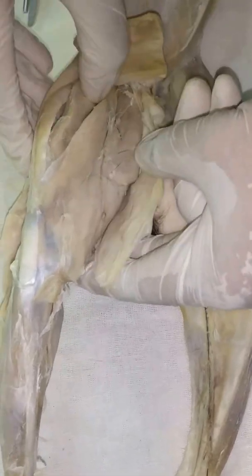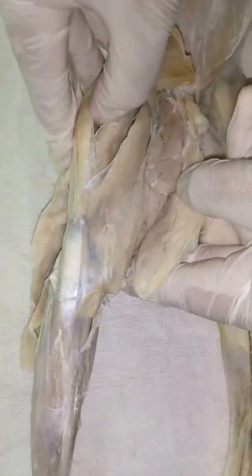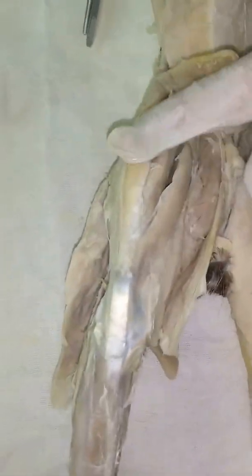Do not use the forceps or scalpel to separate the muscles of the limb. Just use your thumb to press and separate them. We don't want to create artificial divisions. That makes up the quadriceps femoris — four muscles total.